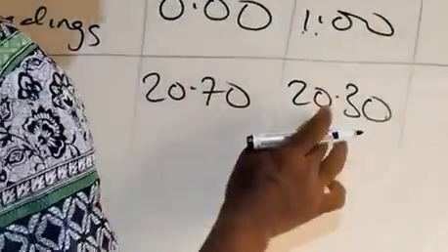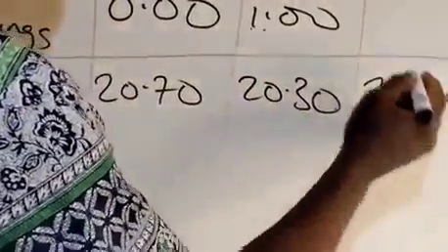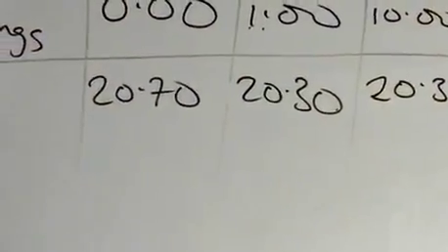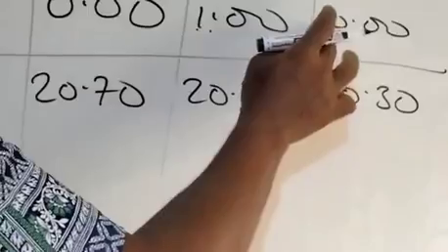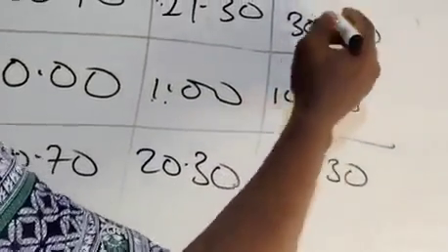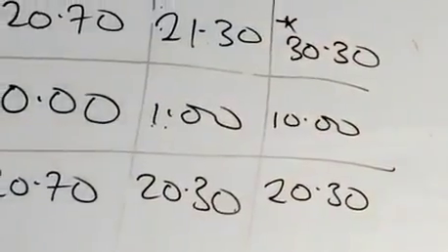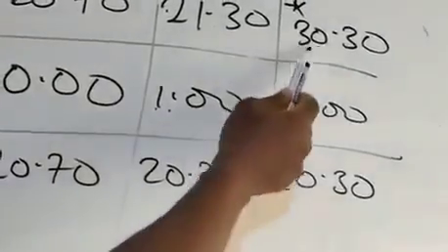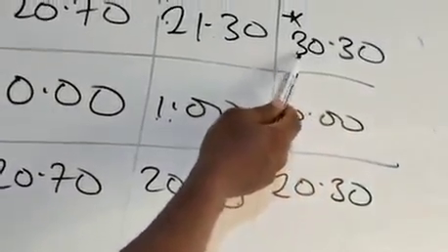So if this is accurate now, and you wish to start from, let me say, 10.00, you can choose any initial value. That means the final is going to be 10 plus 20.30, so you have 30.30. That'll be the final. So I'm going to start from 10 and expect the color to change around 30.30. The nearest whole number to this is 30.